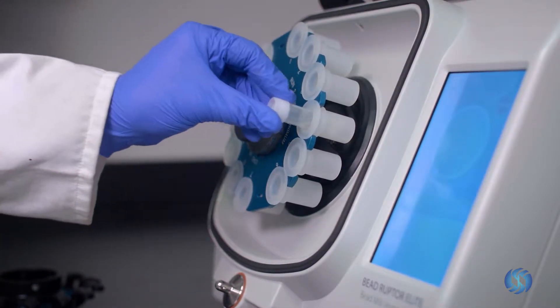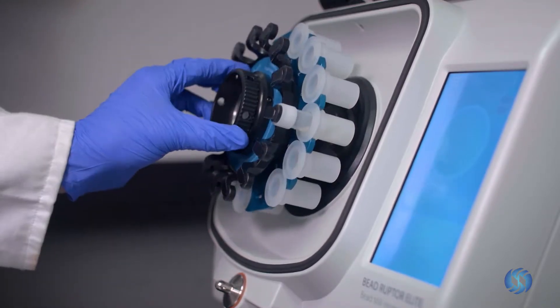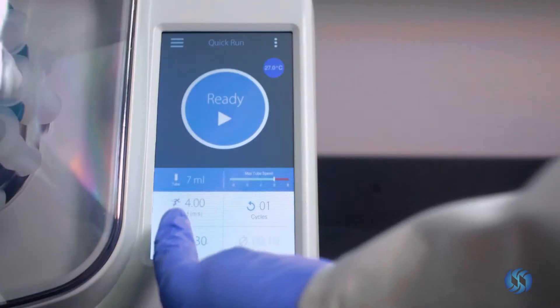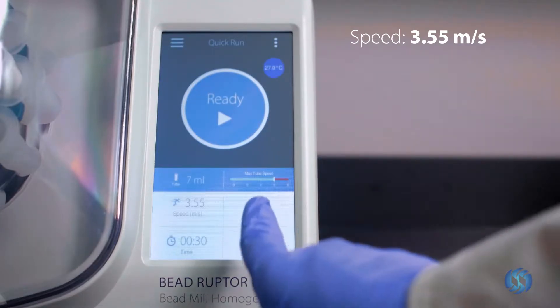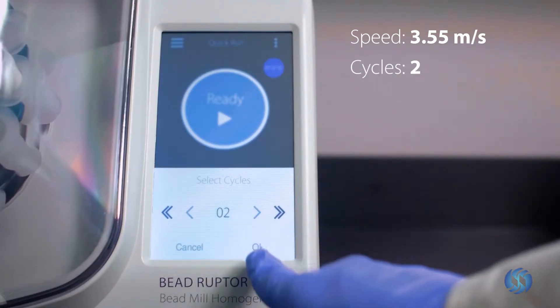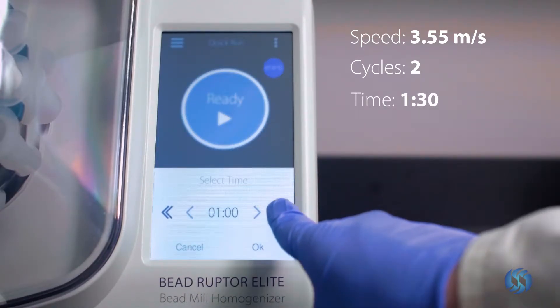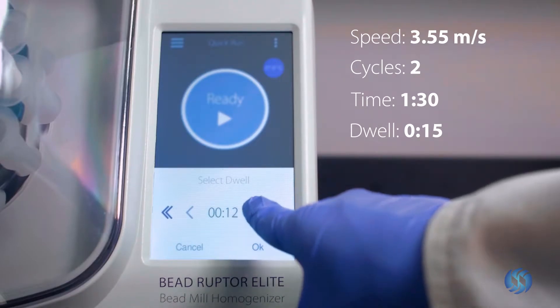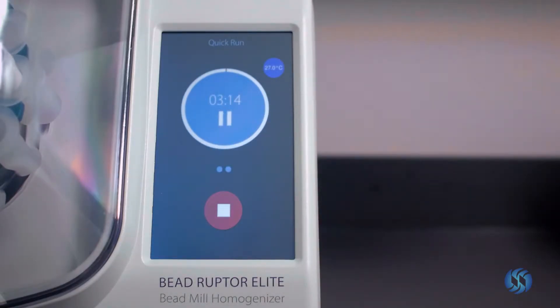Load the 7-milliliter tube into the BeadRuptor Elite. Set the speed to 3.55 meters per second. Set the cycle to 2. Set the timer to 1 minute and 30 seconds. Set the dwell time to 15 seconds. Press ready to begin the processing cycle.